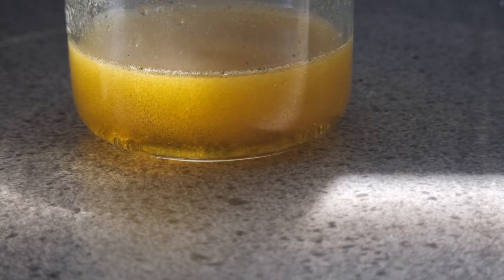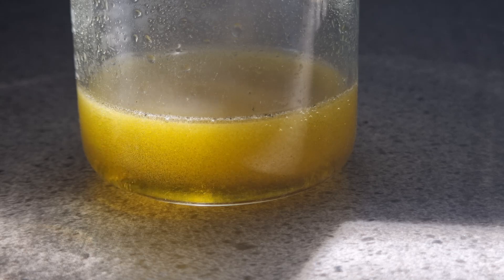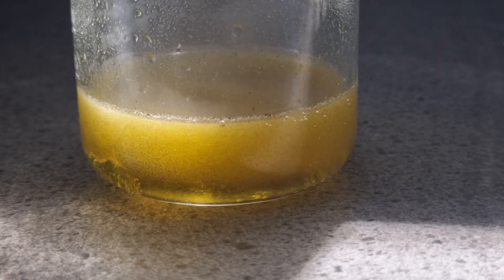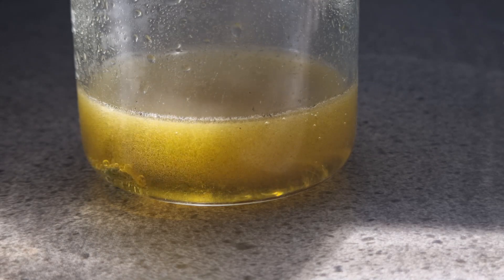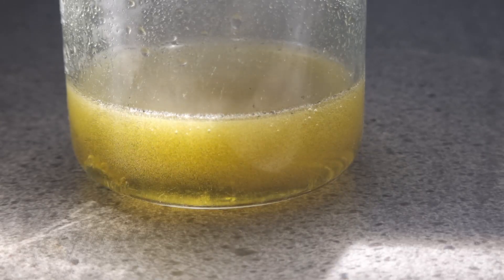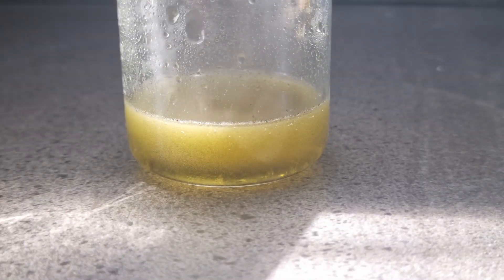This is being played back at 6 times speed. As more and more chromium is reduced to 3+, the green color of the chloride complex intensifies.